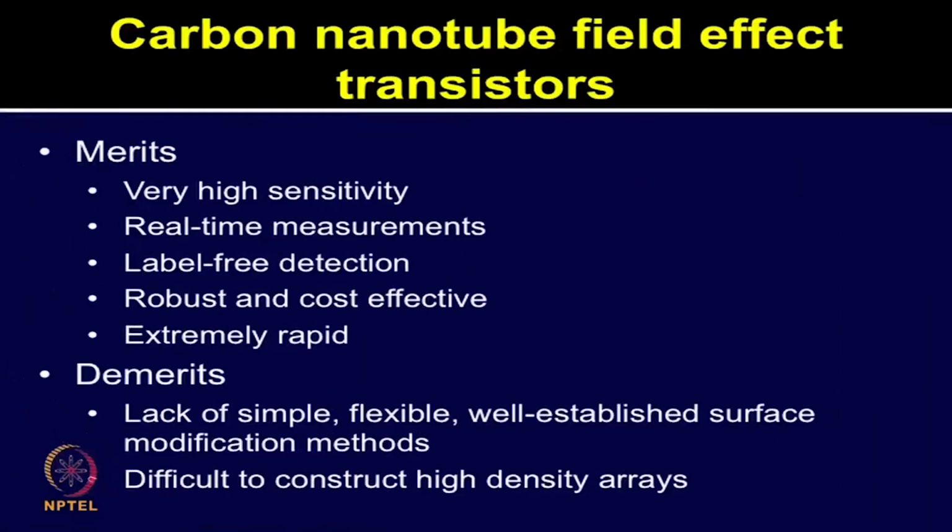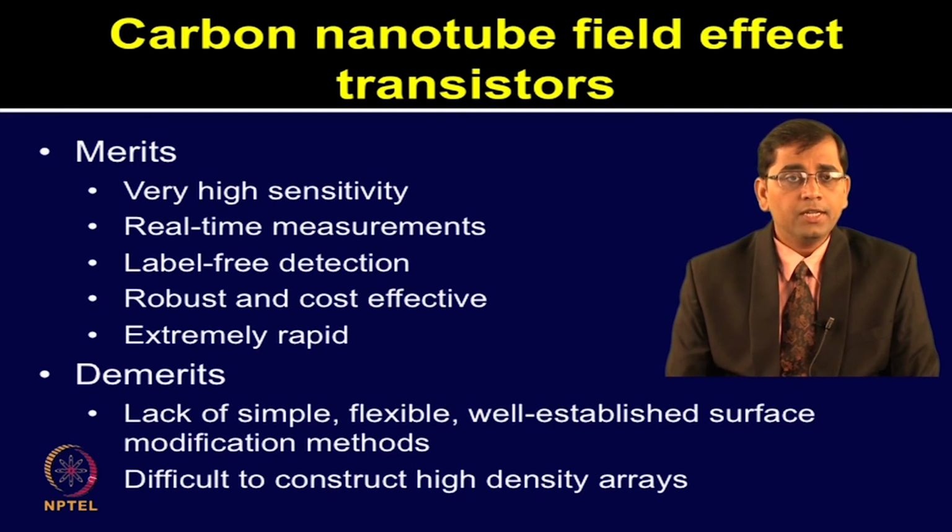Let us now discuss merits and demerits of CNT FETs. This technology offers very high sensitivity with real time measurement capability. One can perform the assay in a label free environment where there is no need of adding a tag molecule. It is a cost effective and robust platform which is extremely rapid as well.